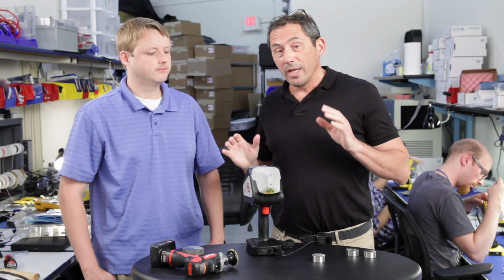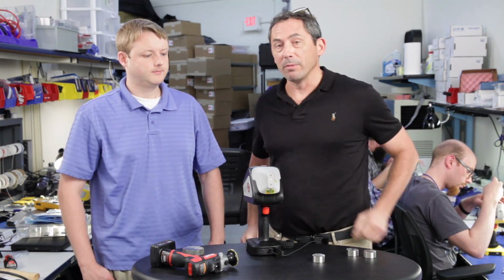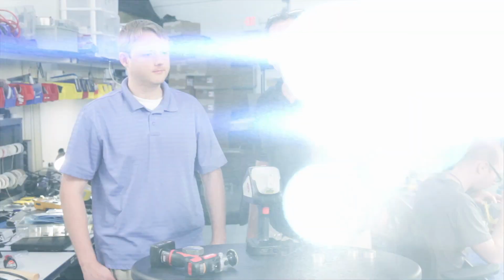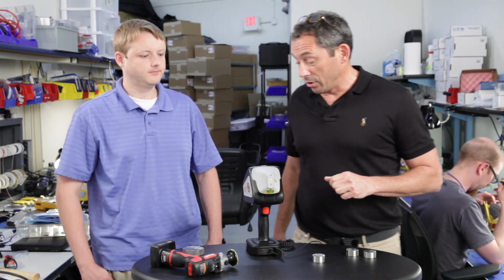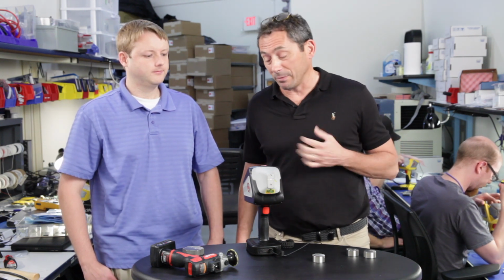So, we had a great week last week in the Gulf Coast demoing the product. Special shout out to Ryan. Some great feedback on our user interface and how the data should be presented. So now we're back to show some of those UI updates on some L grades, and then we're going to move on to a different subject in a few minutes.